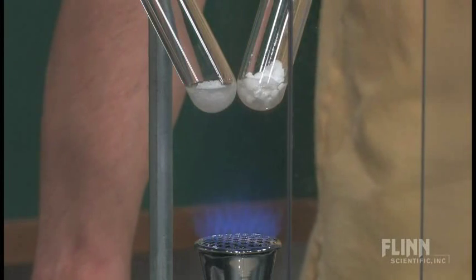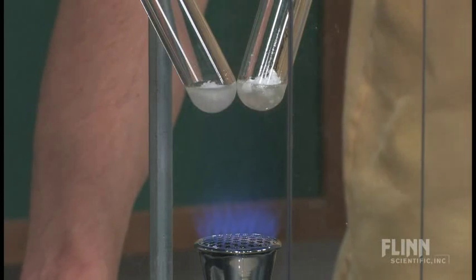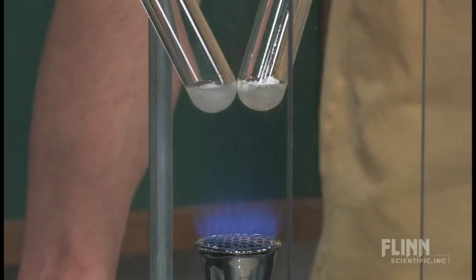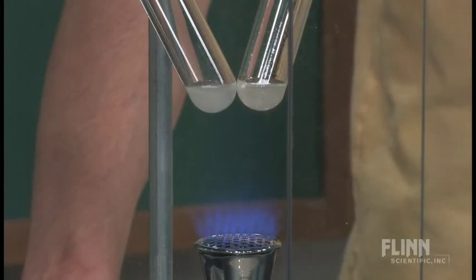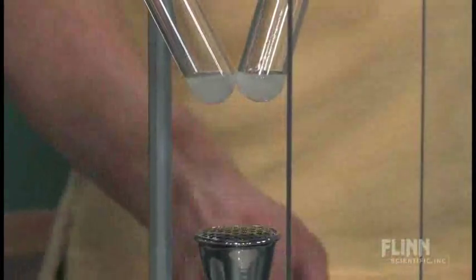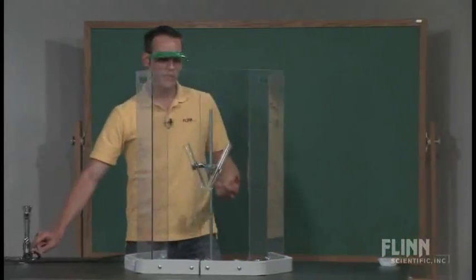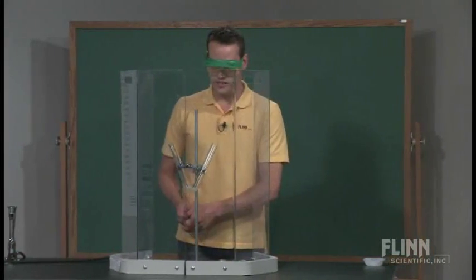And if you look carefully, you can actually start to see small bubbles being generated. That's some of the oxygen that's already starting to come out of the decomposition reaction as these start to melt. And these are just about melted, so we can cut the gas off. Thank you. Make sure you cut the gas off. I usually just take the burner out of the way and turn it off. These will stay melted for a while and will already start generating the gas.